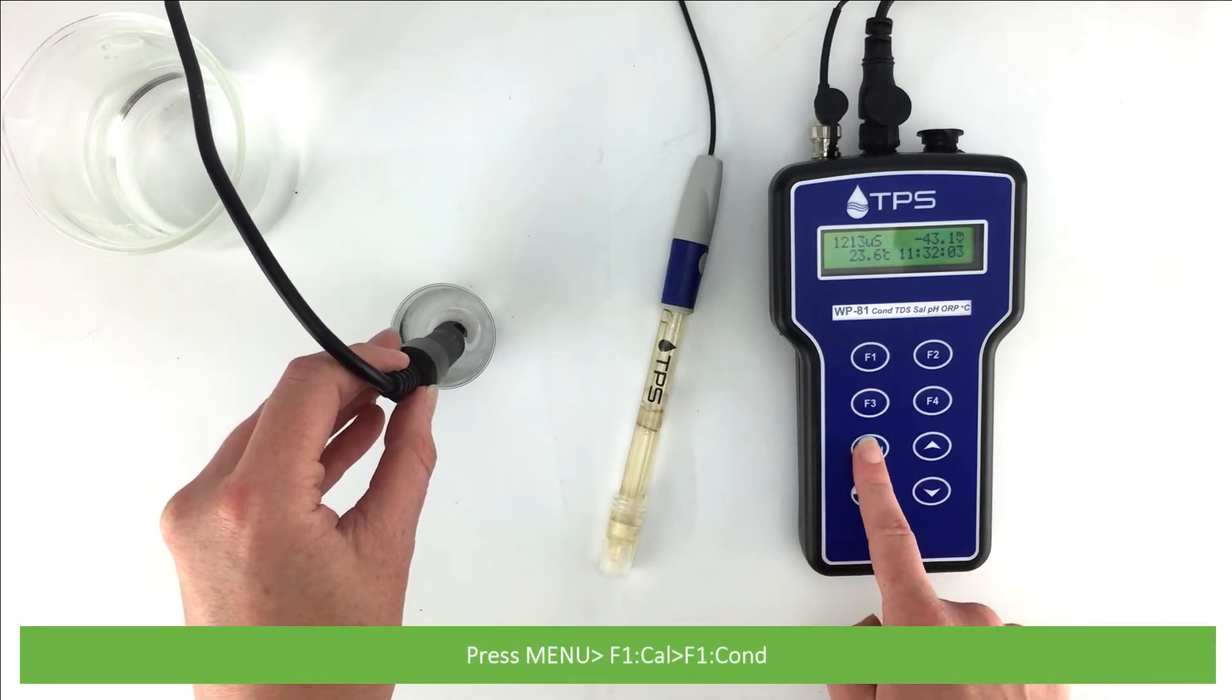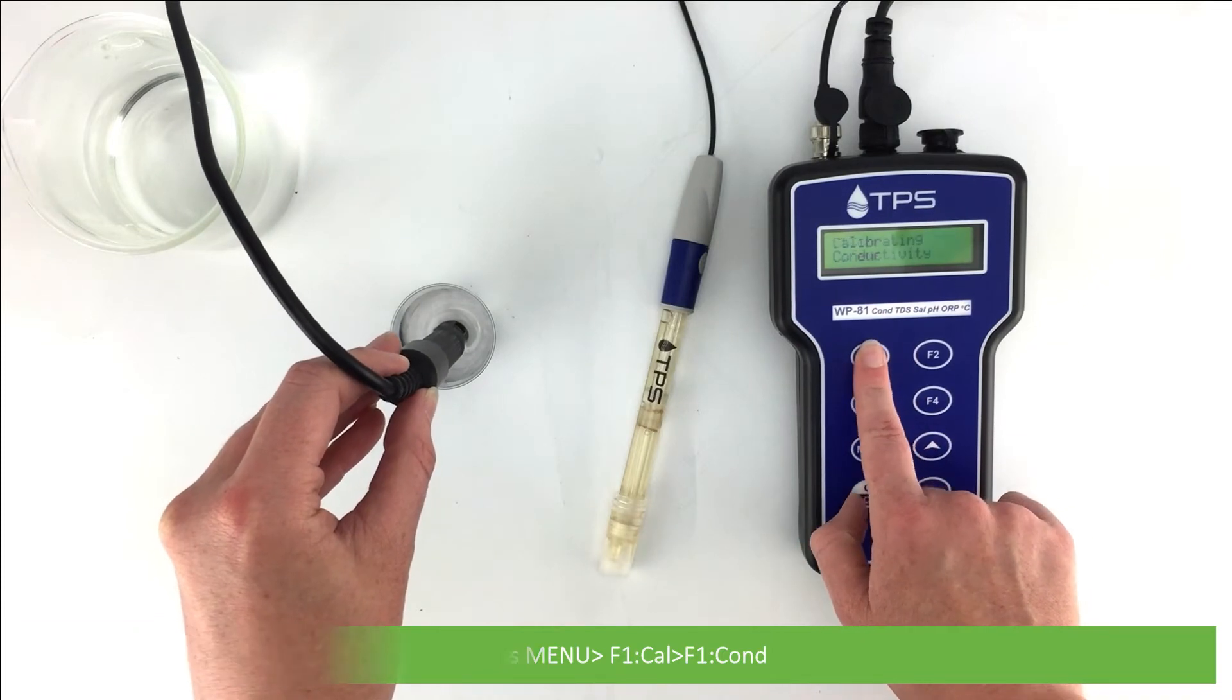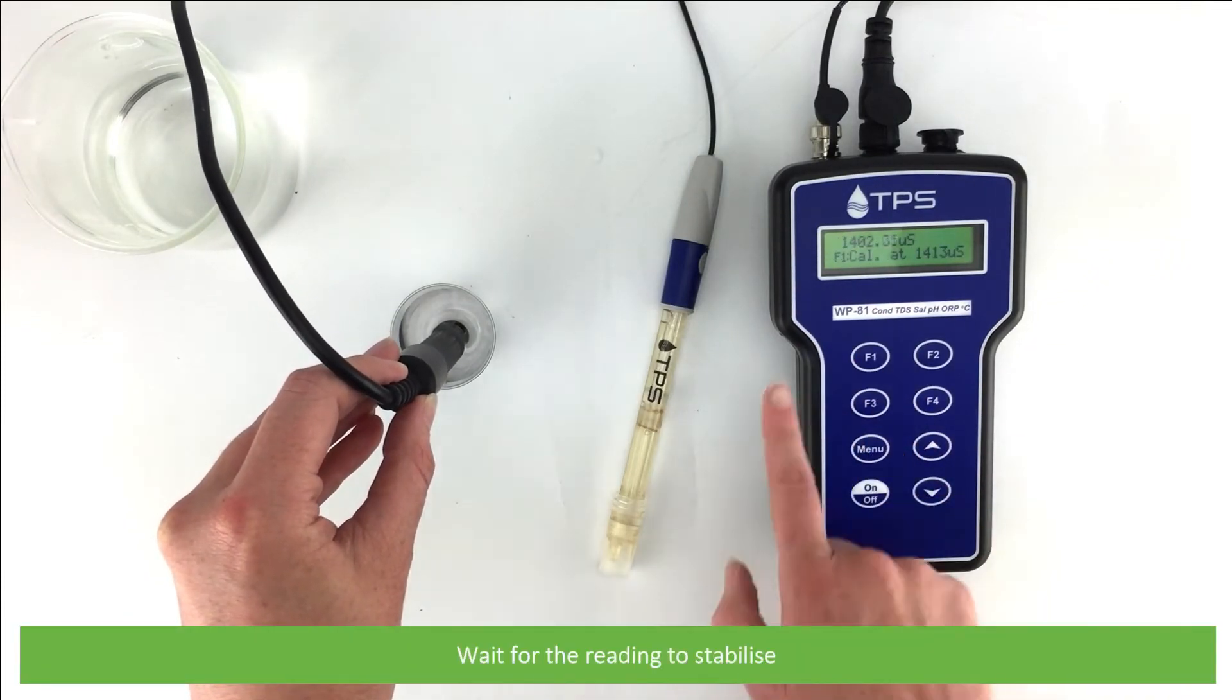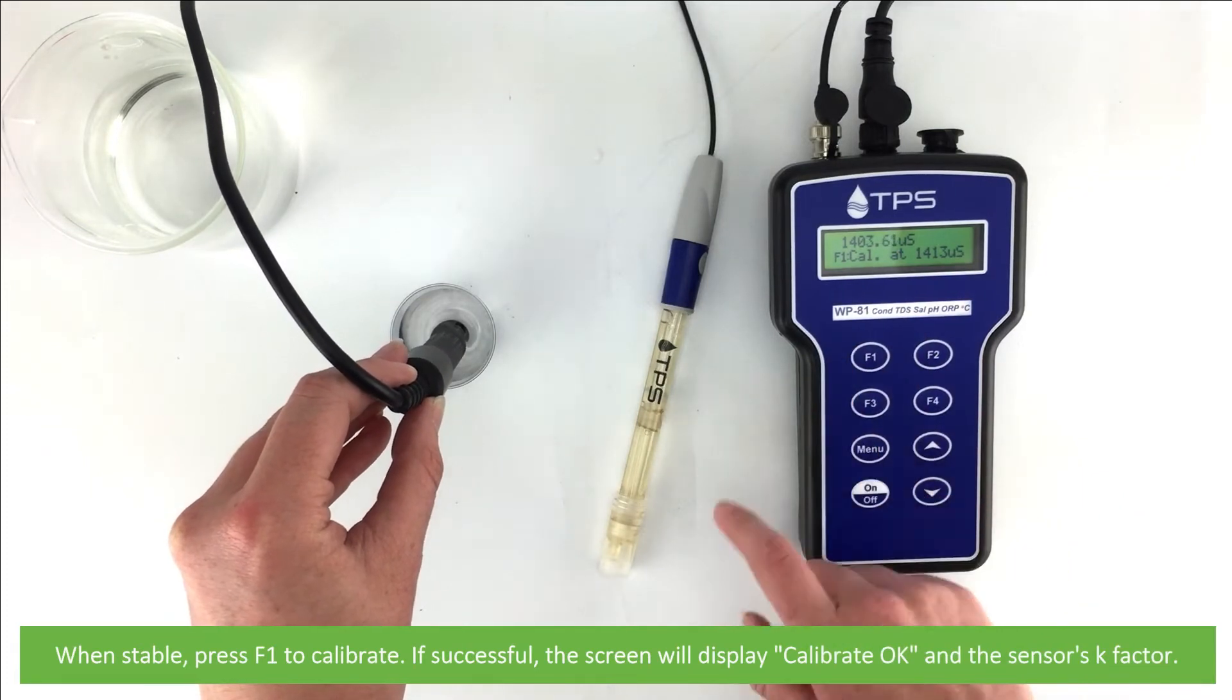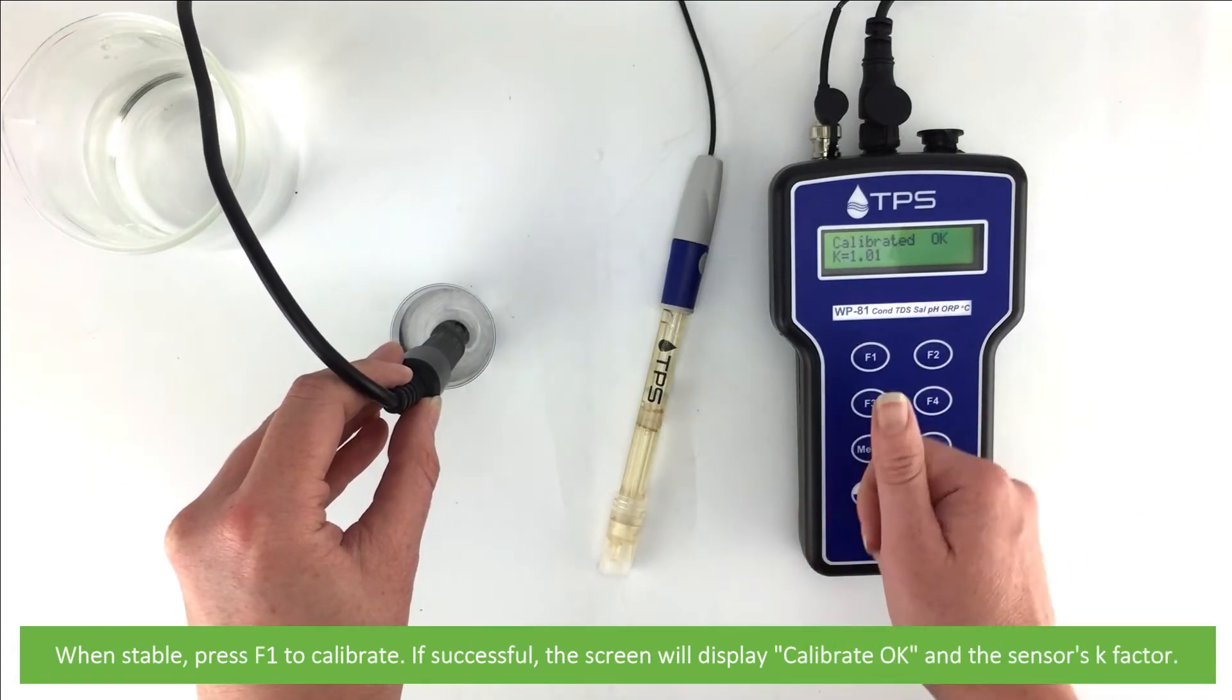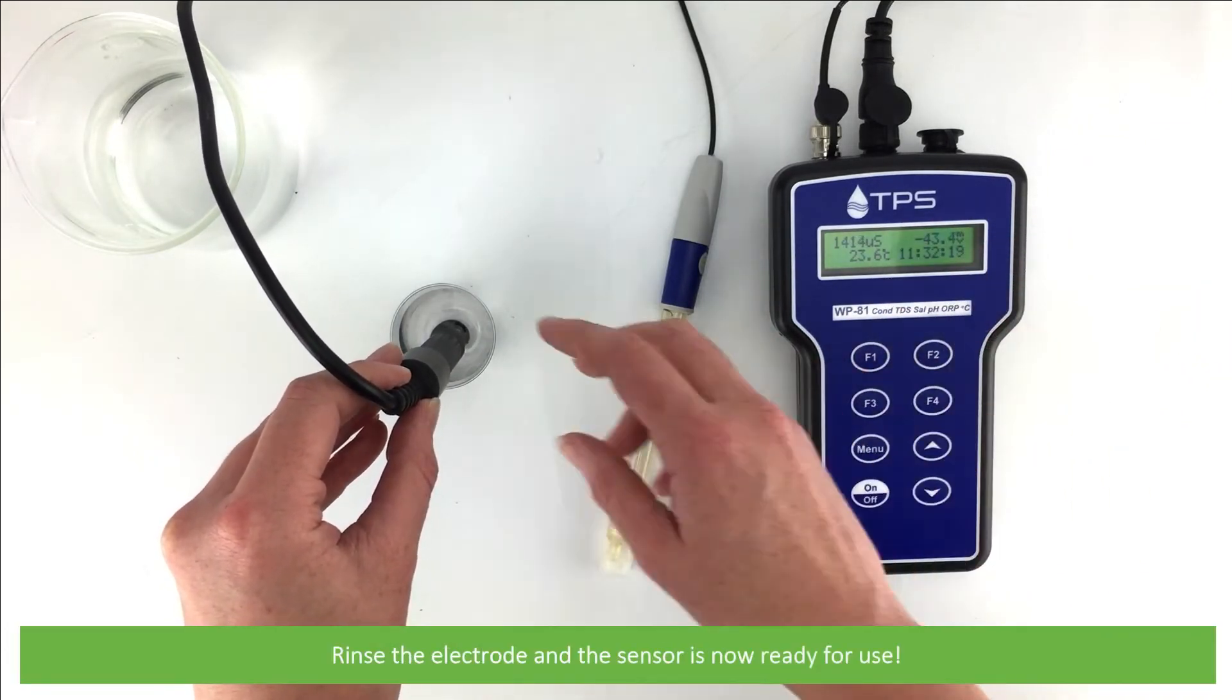Then press menu, F1 cal, F1 conductivity. Wait for the reading to stabilize. When stable, press F1 to calibrate. If this is successful, the screen will display calibrate OK and the sensor's K factor. Rinse the electrode and the sensor is now ready for use.